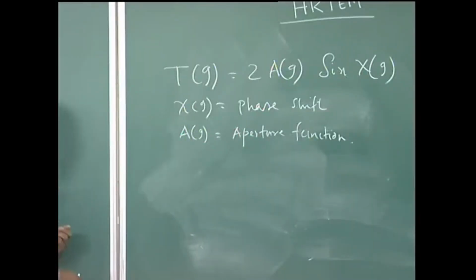So, the wave function at the image plane, a very simplified wave function, can be written like this.